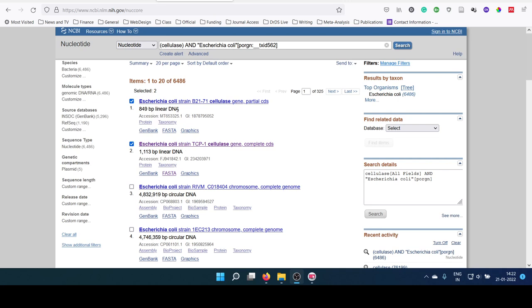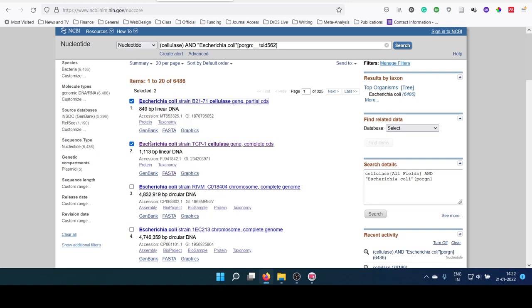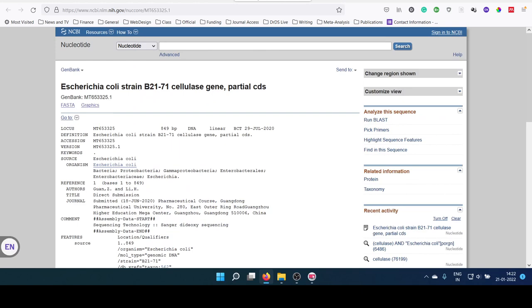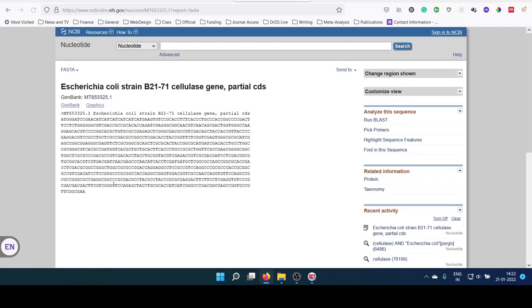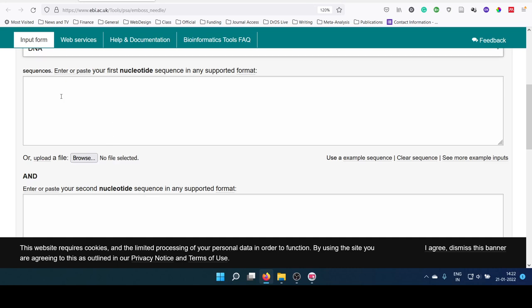Let us download them and compare it. There are two options. One is to open the sequences individually. This is the sequence, first sequence. Then click on the FASTA. This is the first sequence. You can copy that and paste it in the first box.